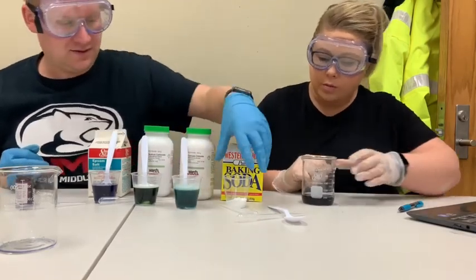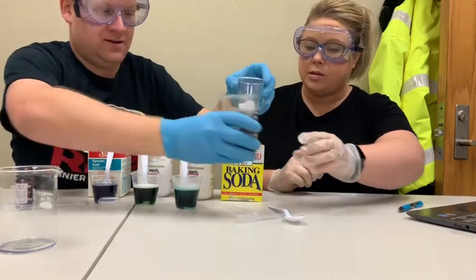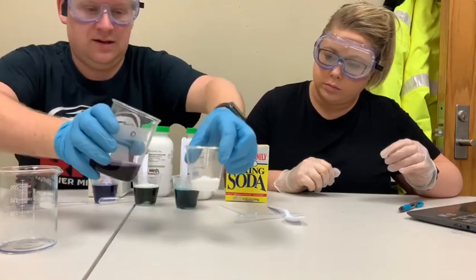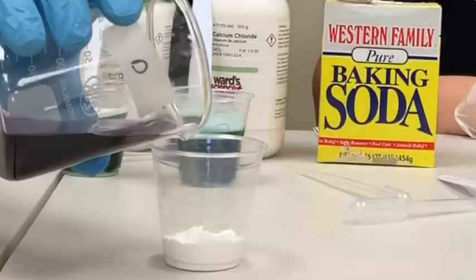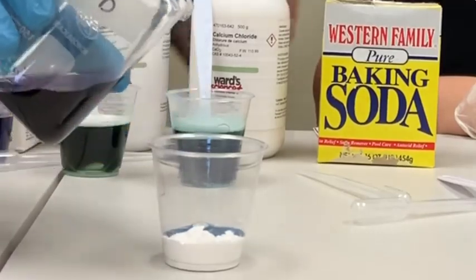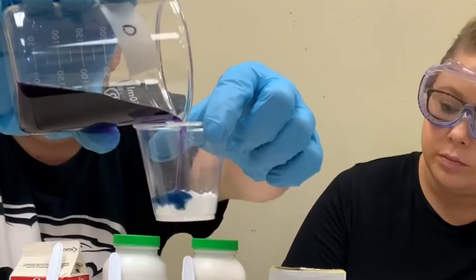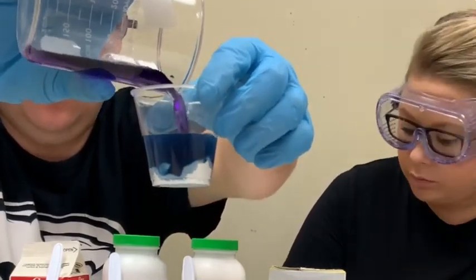All right, and the last one, sodium bicarbonate. Look here. All 4 of these are white-looking powders. Oh, that's a cool color change. I'll see if I can get it closer here. So we have a very strong blue.